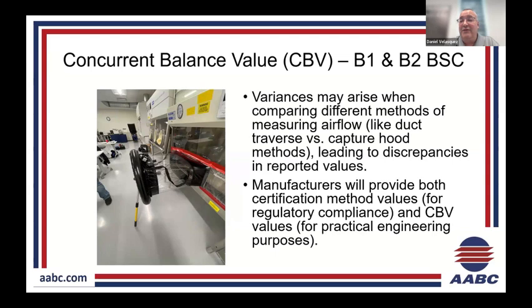All right, so about half of you have felt the pain that I've gone through before. This is why, way back when, I got into the certification world. I was balancing a BSL 3 lab, and I balanced the B2 biosafety cabinets to the required 1200 CFM each via a duct traverse. The certifiers came in, and the first thing they did was fail the bio cabinets, went to the customer and said that my company, Dan from Danforth, didn't do his job. And I had all the information. This was going back to 2003, I believe, where the certifier did that. They were a sub of ours.